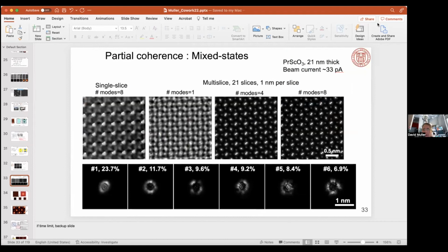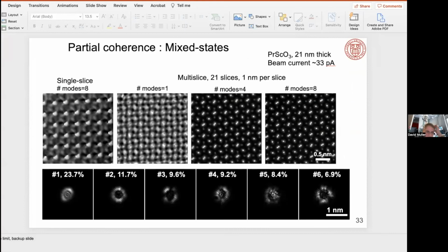So let me pop that one up. So here, very quickly, is what the modes look like. This was an early one. In fact, what we hadn't taken account of in this particular analysis was that there's still a little bit of point spread function on the detector. And so without accounting for the point spread function of the detector, some of that got folded back into the modes, and that wasn't a very efficient use of the modes. So we needed about 8 modes, and then once I put the point spread function of the detector in, we can drop down to about 4 modes.